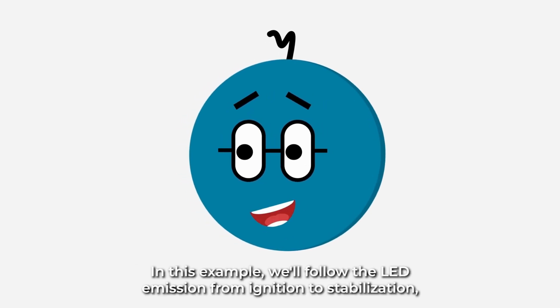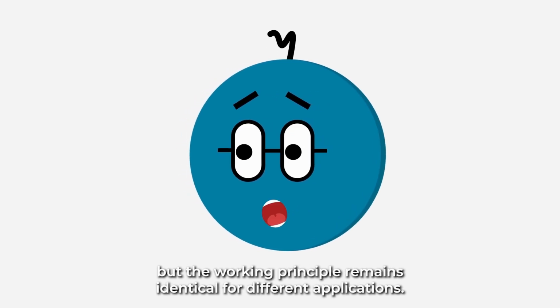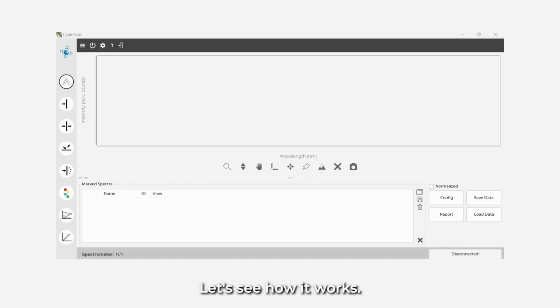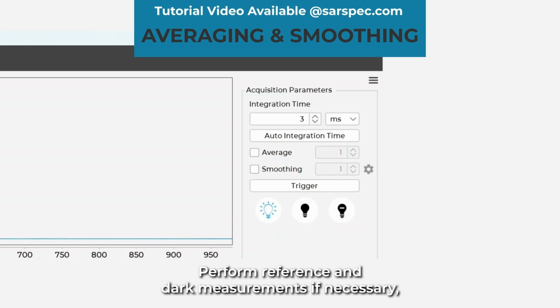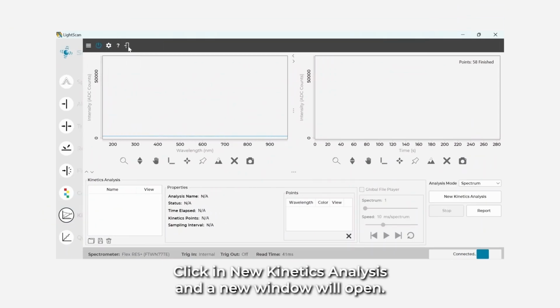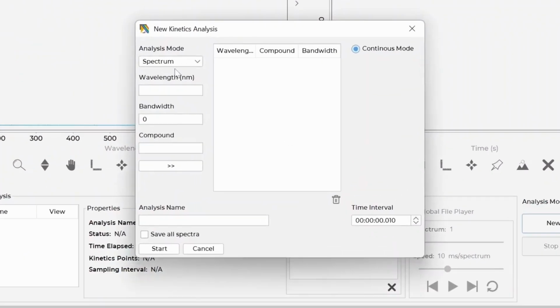In this example, we'll follow the LED emission from ignition to stabilization, but the working principle remains identical for different applications. Let's see how it works. Turn the software on and optimize the acquisition parameters. Perform reference and dark measurements, if necessary, and go to the Kinetics module. Click in New Kinetics Analysis, and a new window will open.